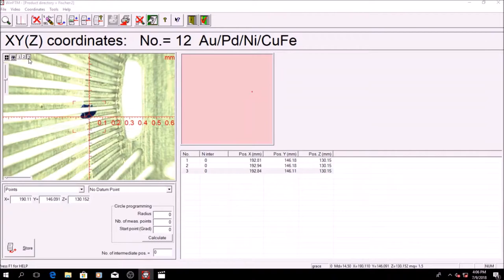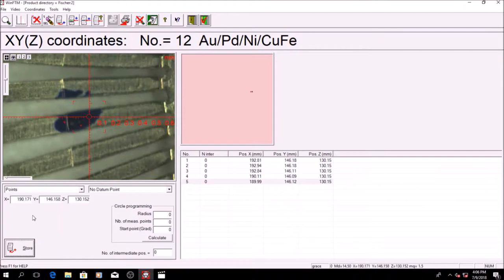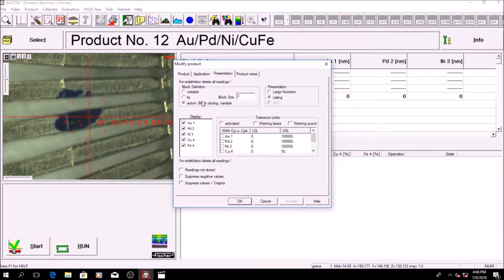Next, click on info followed by automatic block closing variable and change the block size to 3. Afterwards, click run to start the automated measurements. The measurement is complete.